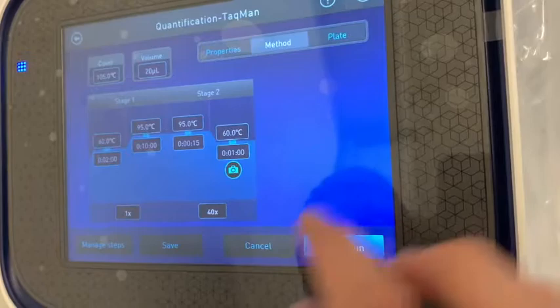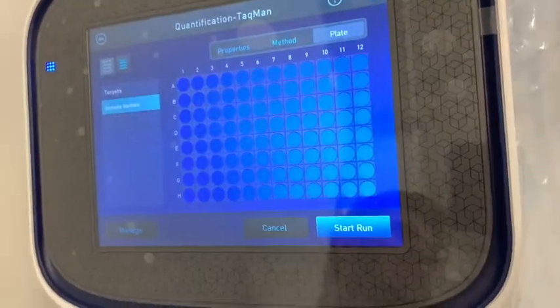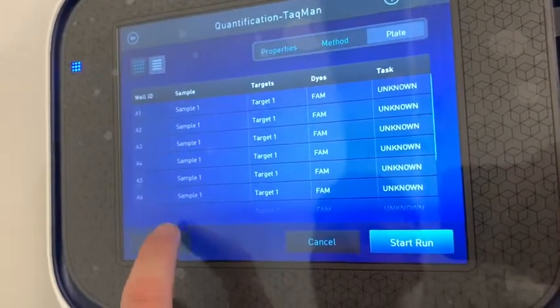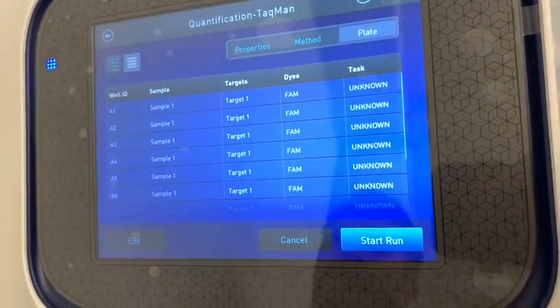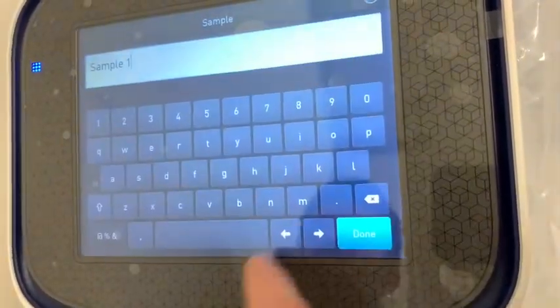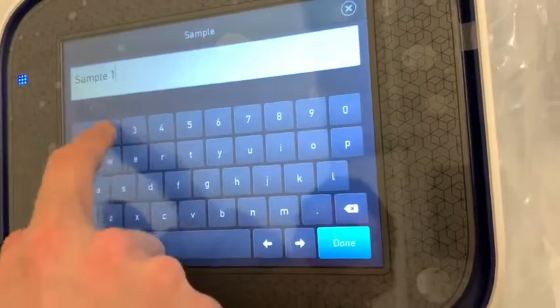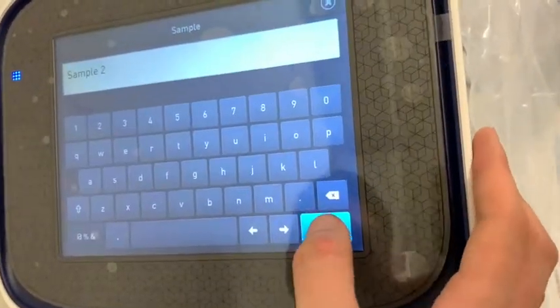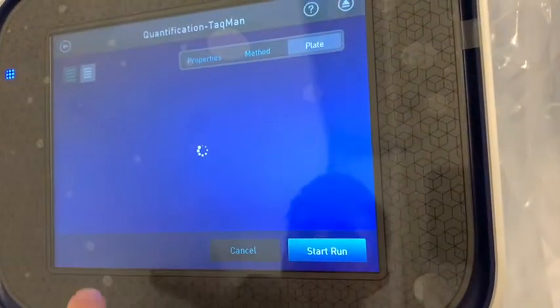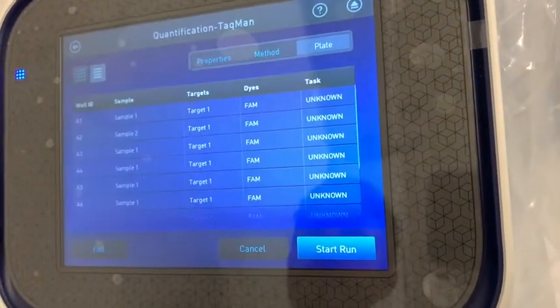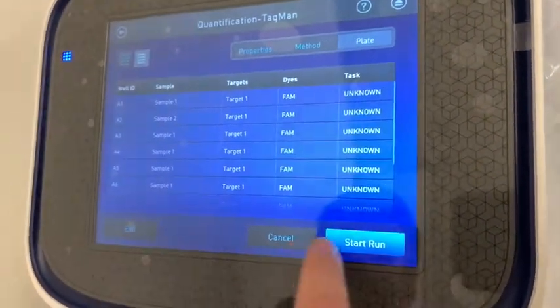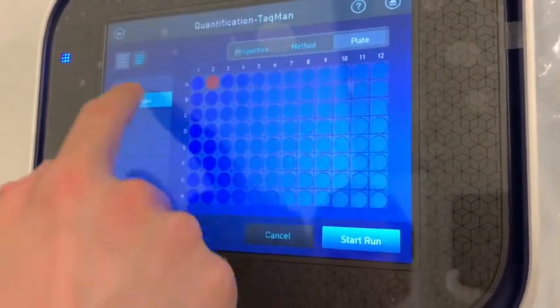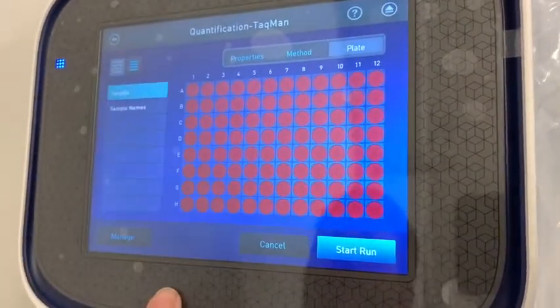Go to Plate Setup and click on List. Click on Edit and write the names of your samples. After this step, go to Plate Layout, then go to Targets. You can see everything is marked in red.